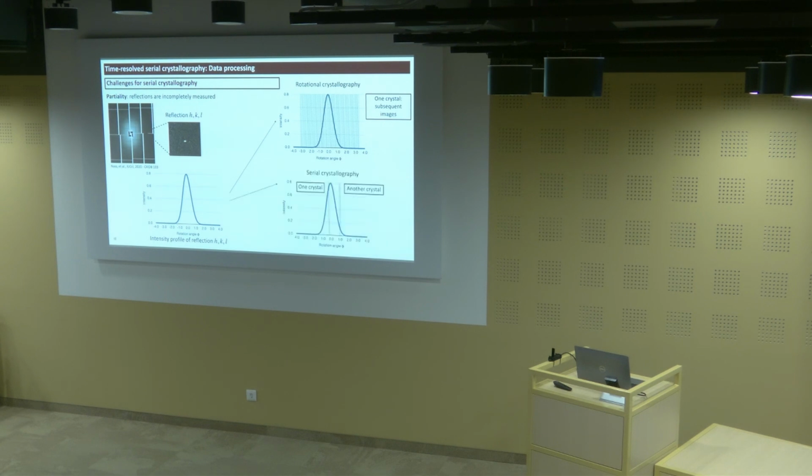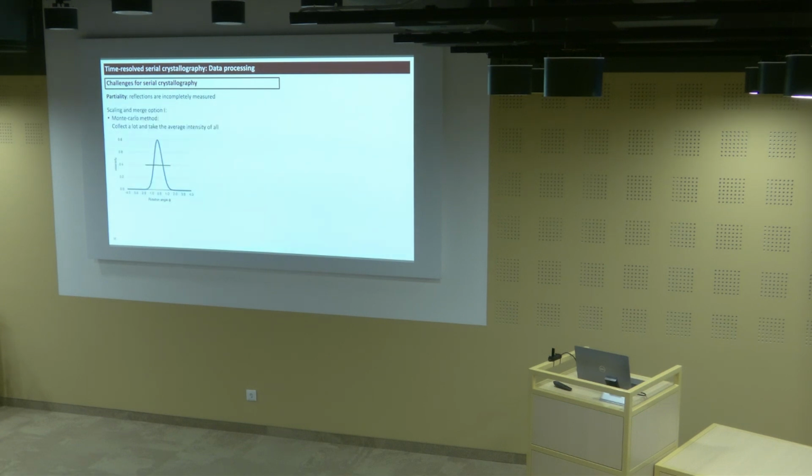In serial crystallography, this is not at all the case. So for one crystal, we might probe just this part. From another crystal, we might probe this part. So this makes it very complicated to regenerate that full intensity profile. So there are different ways to deal with it.